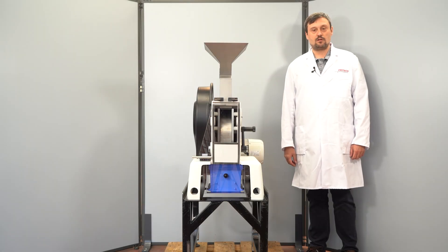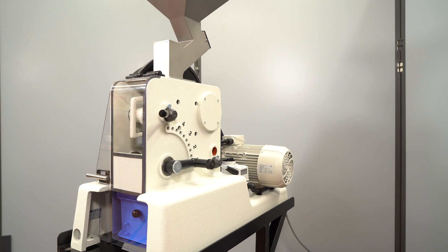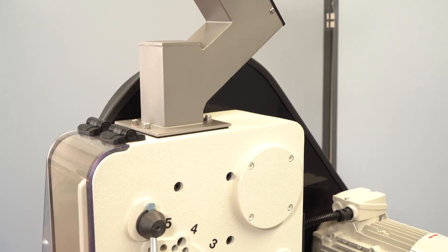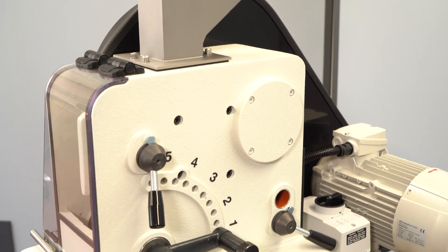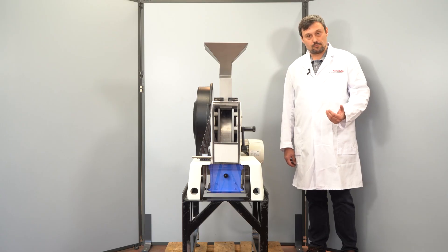Hello and welcome to our demonstration of the Pulver Resider 1 Jaw Crusher. Today we want to show you how the instrument operates to achieve the best results and how to handle the whole cleaning procedure.